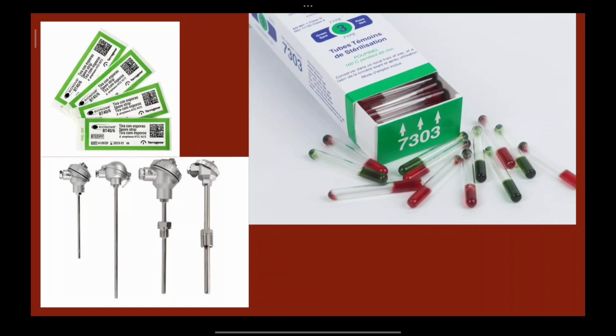So now we have covered the various aspects of sterilization and disinfection and its role in microbiology as well, and various other clinical practices. It is essential to learn about sterilization and disinfection in order to understand how the microbial lab works without any infection, or the precautions that the microbial labs are taking in order to prevent the exposure of the infection to the general public, or contracting the infection by a professional healthcare worker.